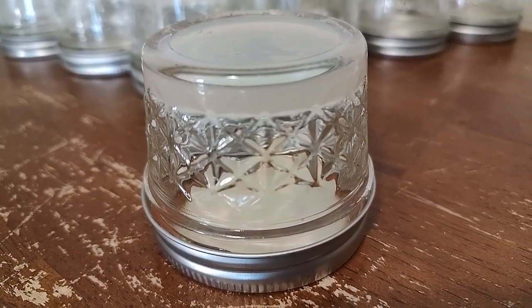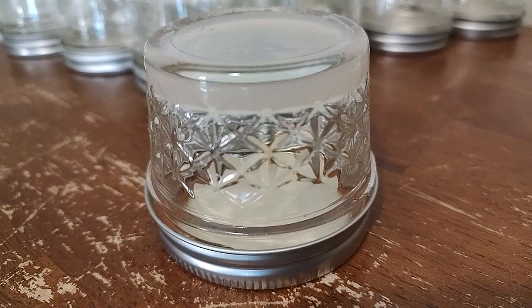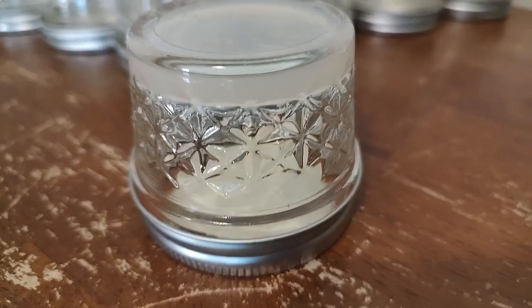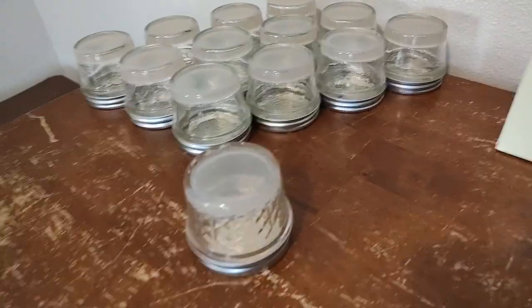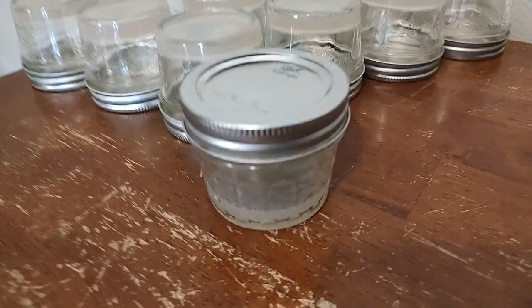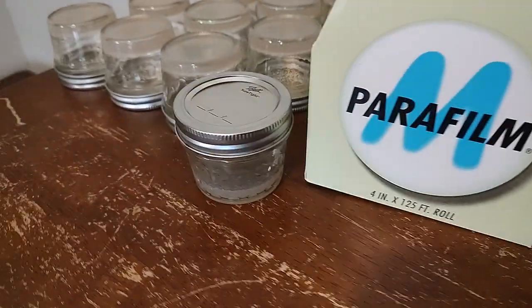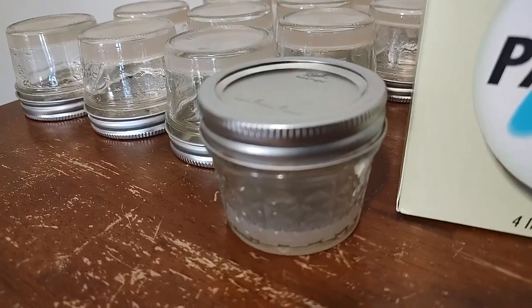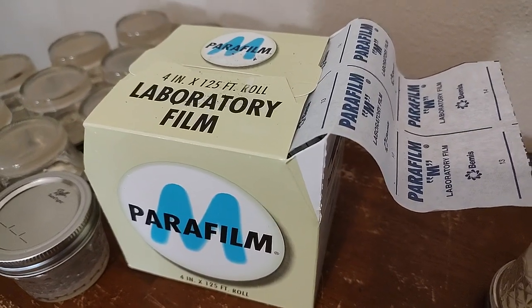When you're creating an actual Petri dish — if you've seen our beginning agar videos — when you do a transfer or cloning on a regular old Petri dish, you don't have the ring to seal it. So you use Parafilm, which is tape for Petri dishes. After you do your clone or transfer with the Petri dish, you put Parafilm around it, which seals the dish.